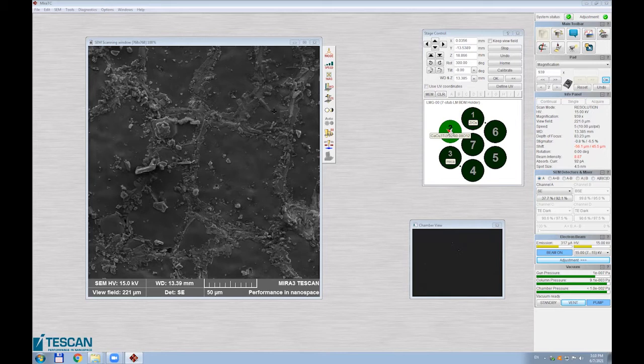While for copper, it's the opposite. These grain boundaries are full of copper. Calcium is similar to titanium, so these grains are rich in calcium and the boundaries are not filled with calcium. If you run it for several minutes, you will have a better and clearer map because it's stable. So I will stop it here now.